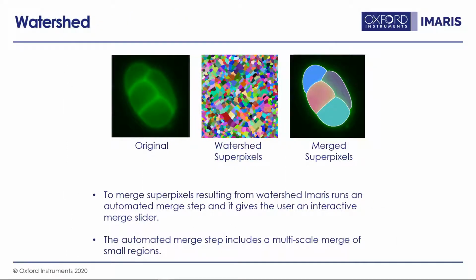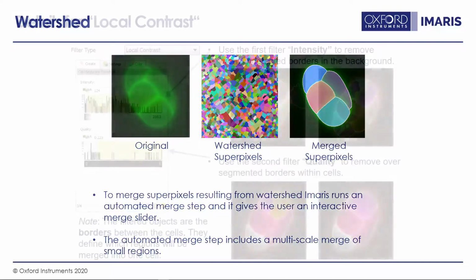So how do we move from our data set to something where we have our cells nicely segmented? The watershed algorithm or image segmentation, how does it work? We can imagine that the picture is more like a landscape with local peaks, with basins and minimums, and this is how it's cut into smaller regions. And then there is some automated merge step, which is connecting them back together all the way to the desired result.